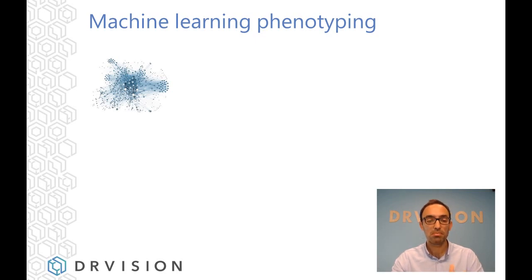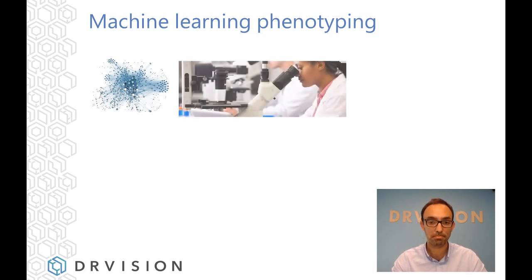But what is this machine learning phenotyping, and how does it all work? I've summarized it in this one slide. We do have a full webinar, which is 45 minutes or so, on our YouTube channel and also on our website. I took this slide from that webinar, but I can summarize it very quickly here in case you have not come across the concept, and this gives you an opportunity to catch up.